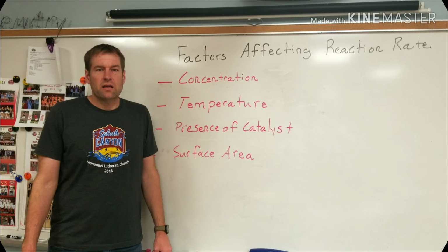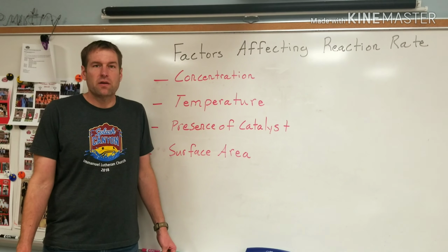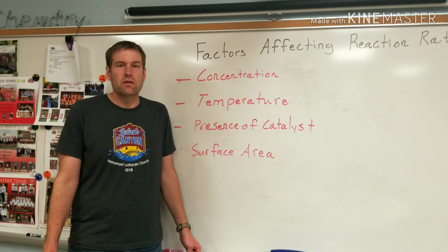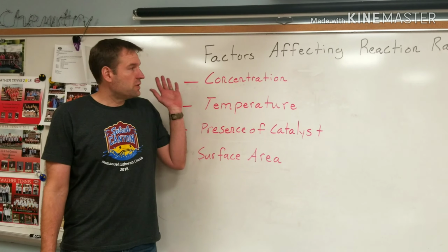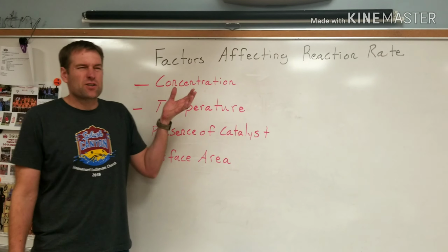Chemistry class, we're back in the chemistry classroom to look at a demo today. As always, back behind the camera, I have my son Ethan. Say hi, Ethan. Hello. All right, so today's demo, we're going to look at factors affecting reaction rate.